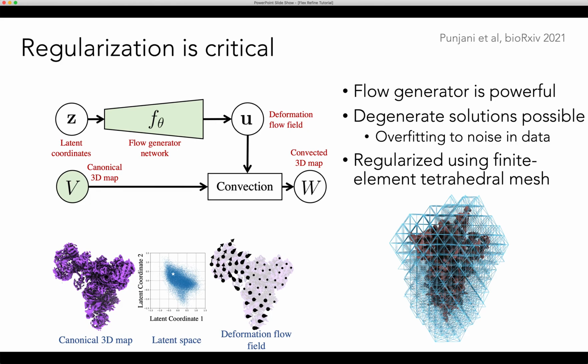So when we do have a fully continuous mesh, that can cause problems for these kinds of proteins in cases where we want to resolve more intricate motion, especially of domains or subregions or subunits that are very close together but move independently. And although none of them move rigidly necessarily, they still move in a way where each one moves separately from its neighbors. And that's the kind of motion that we want to capture in this case.